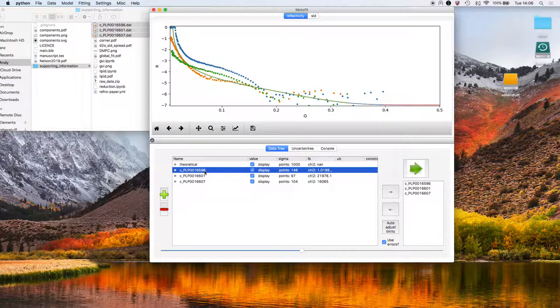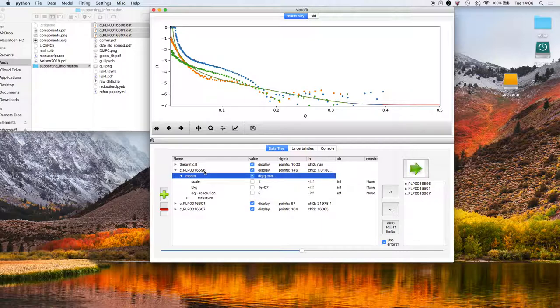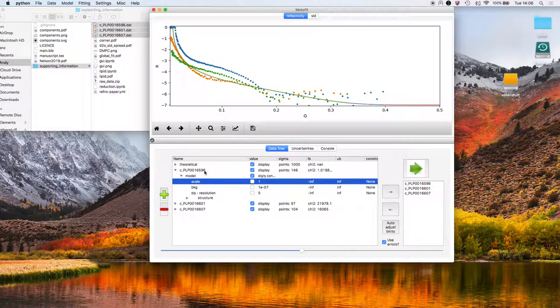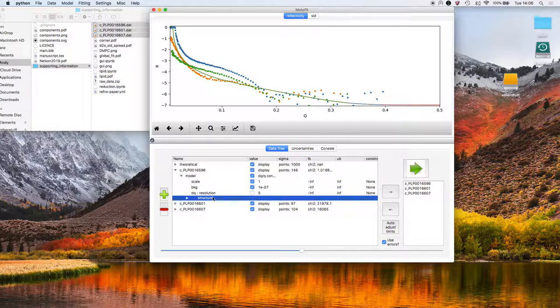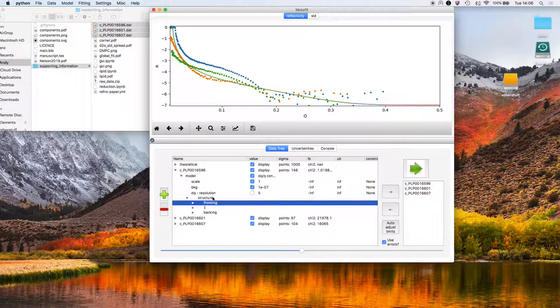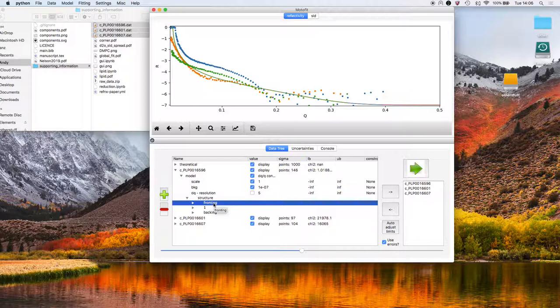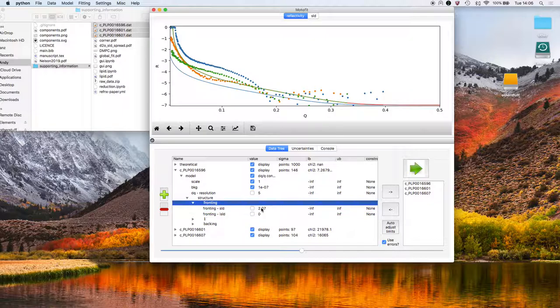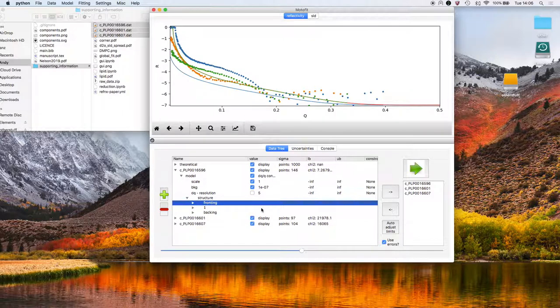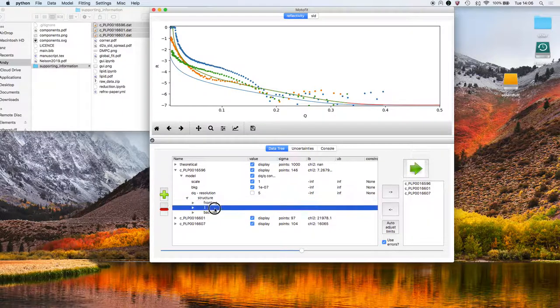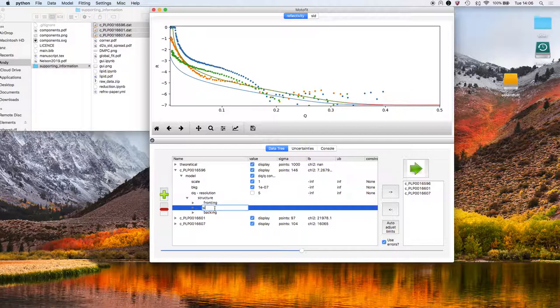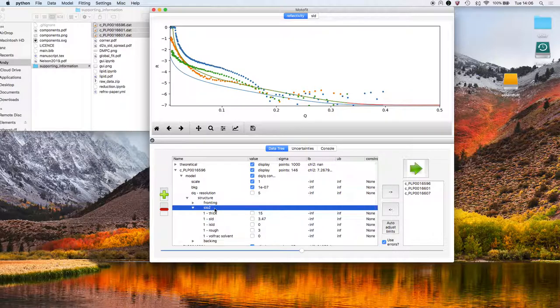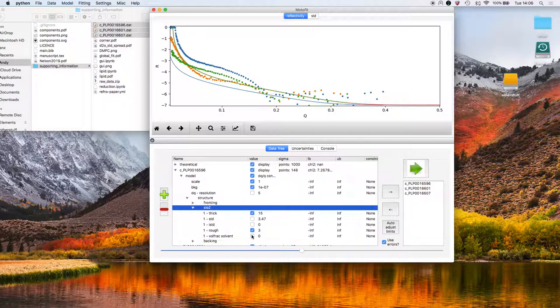The first thing that we've got to do is set up the model, so I'm going to go into this tree. I'm going to say that we want to fit the scale factor, the background. Let's go into the structure. At the moment, there's three layers. The fronting medium, that's where the neutrons come in from. That is silicon in this case, so that would be 2.07. The first layer is going to be a silicon dioxide layer. That's the native oxide. We're going to want to fit the thickness of that layer, its roughness. That's the roughness of the silicon dioxide silicon and the volume fraction of solvent in that layer.